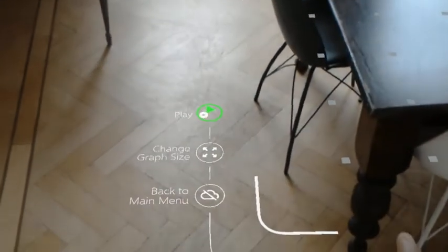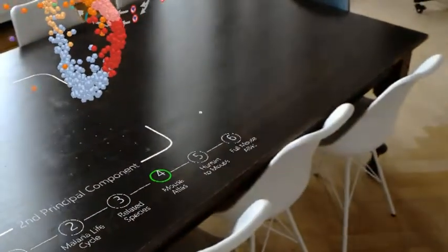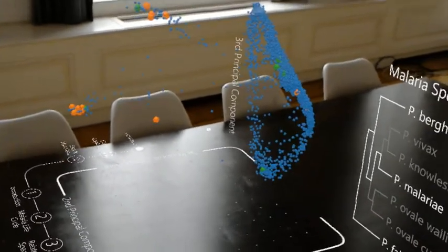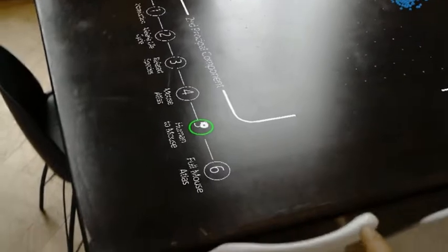And this is not just one data set. So there's quite a lot of data sets that we can do. If we zoom this back down, we can look at different data sets that are in this research, and they've all got different stories.